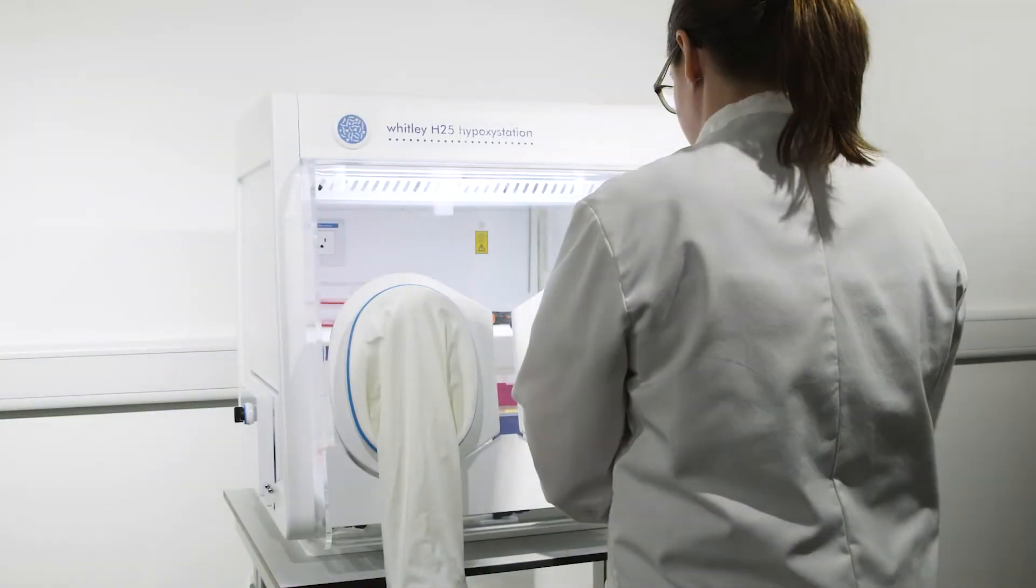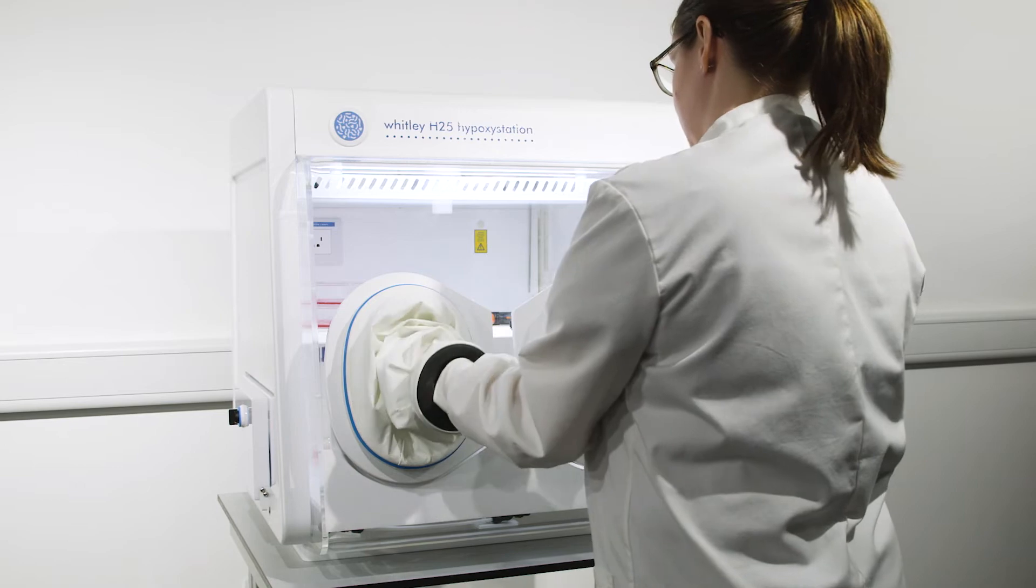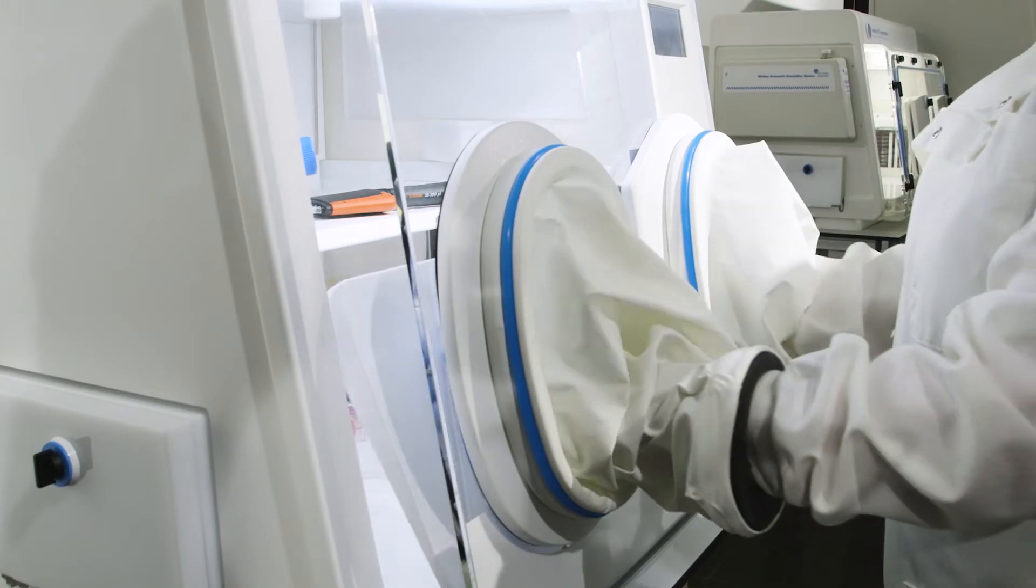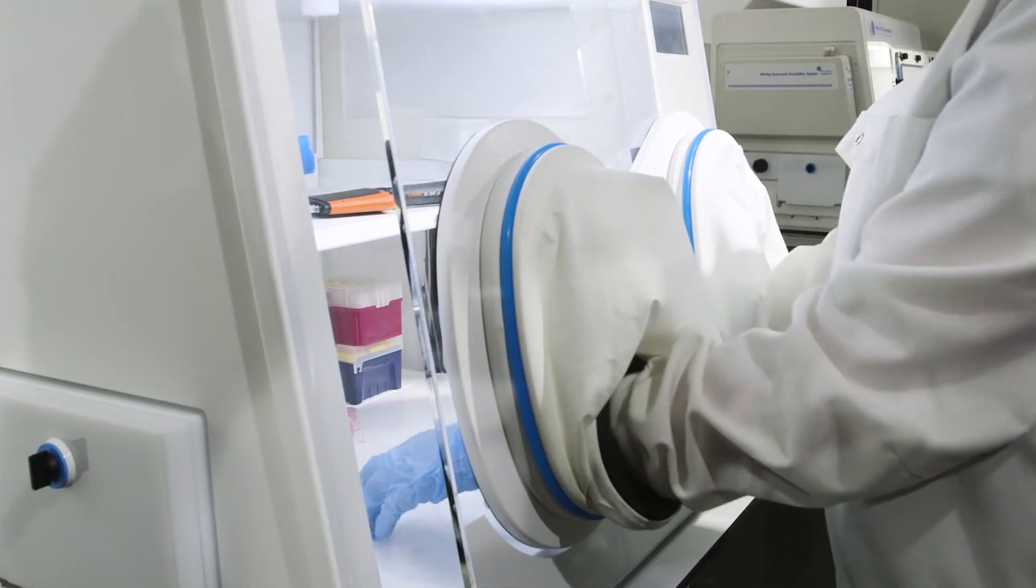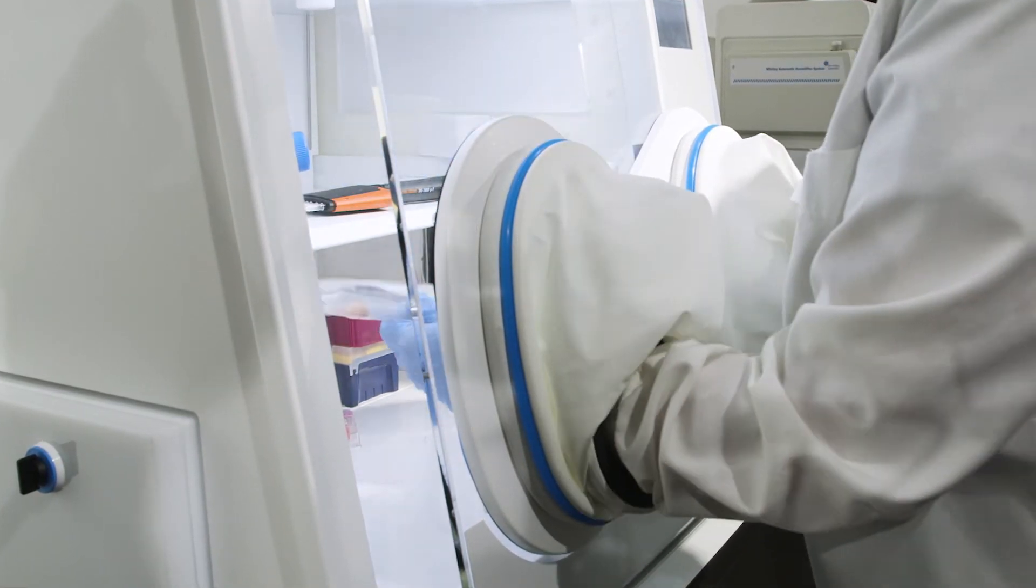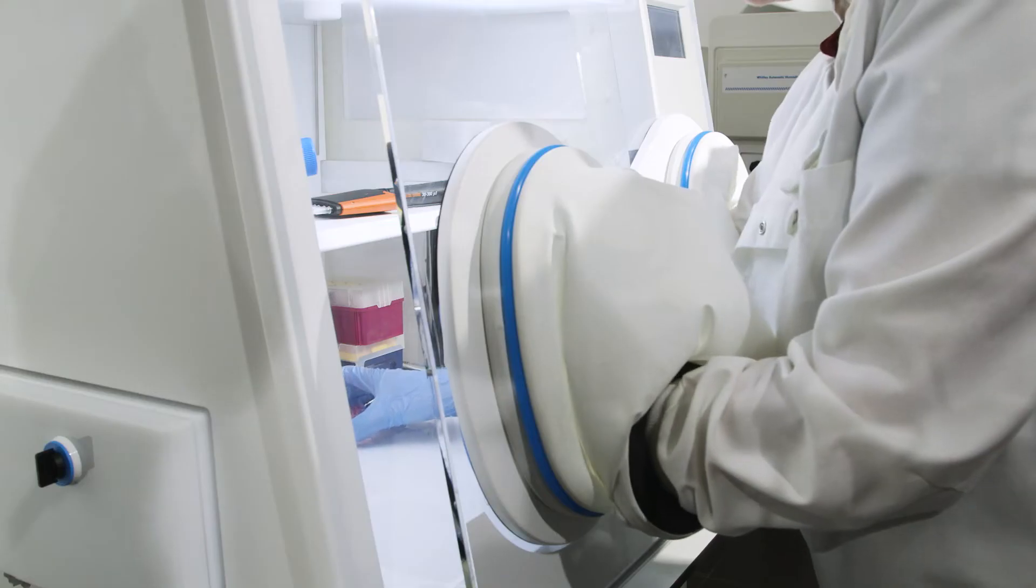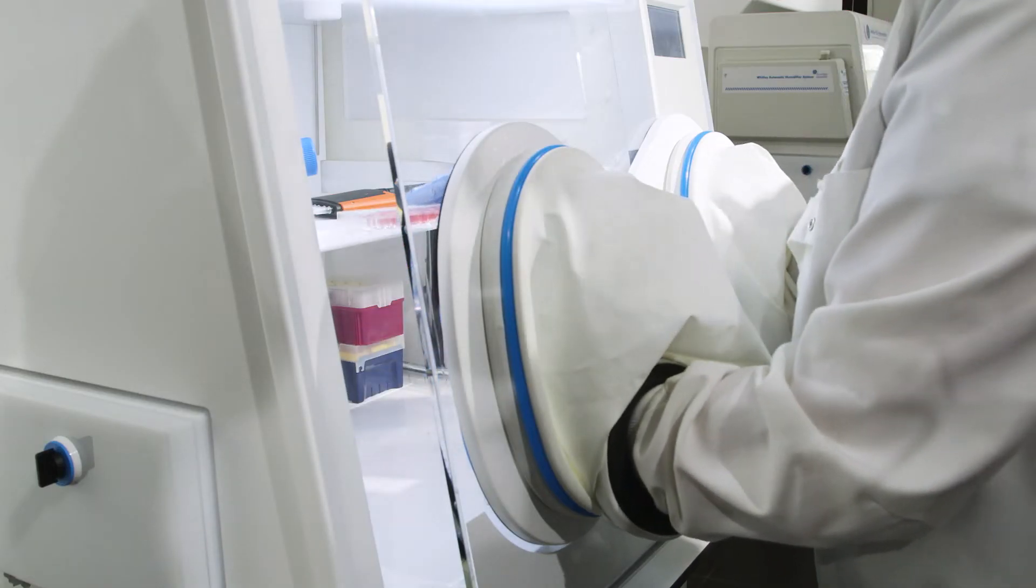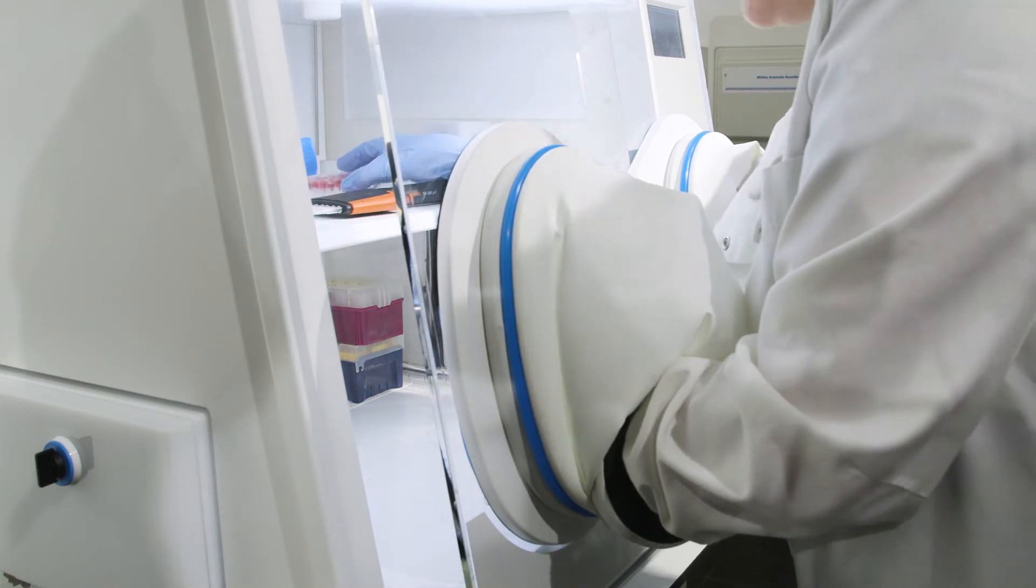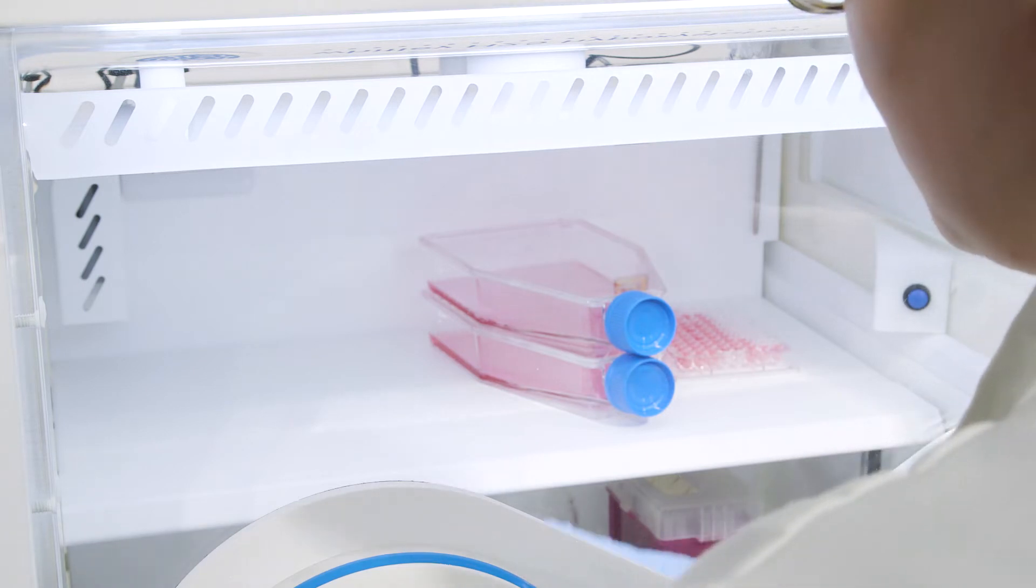The H25 is the most compact hypoxie station in our range. It allows you to accurately control oxygen in 0.1% increments up to 20%, carbon dioxide in 0.1% increments up to 15%, and relative humidity up to 80%. This flexible workstation can also be used anoxidly if required.